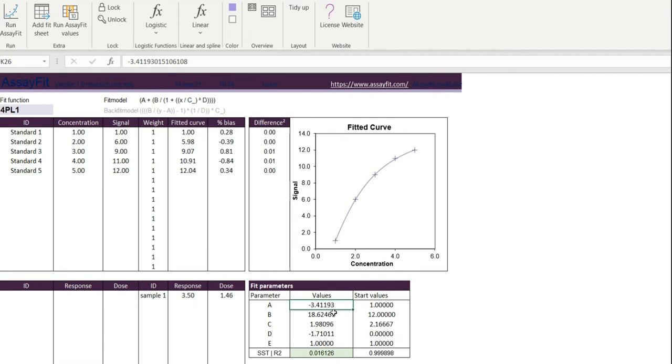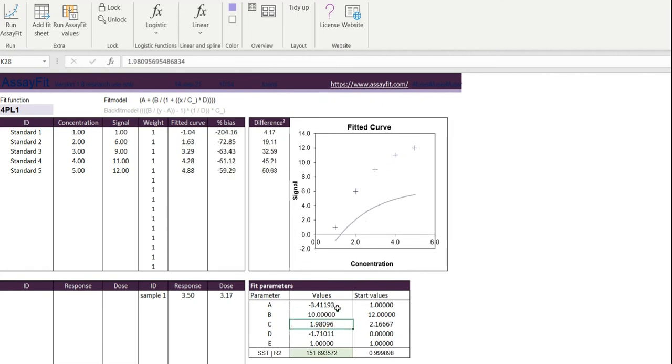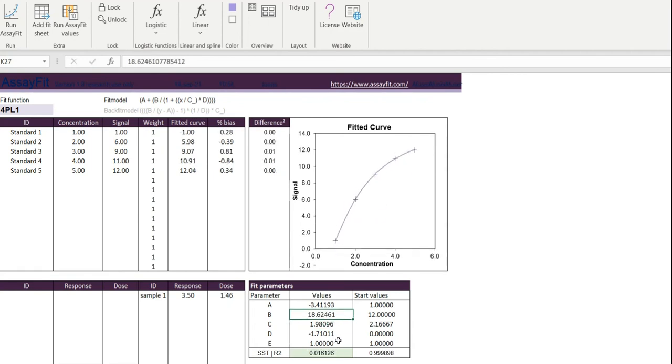Changing the value of parameter A and parameter B, change the height of the fitted curve. The change of the four parameters, as is done here, with the feedback of the sum of squares, is essentially what the optimization algorithm does. The optimization of the parameters is a complicated process, and this is what is called curve fitting.